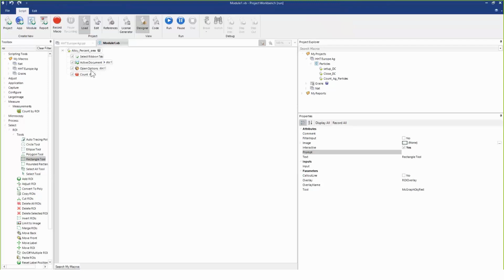In this case, smart segmentation, what parameters I want to measure. And if I have any filtering going on to remove particles that are not what I want to measure, either by size or any other property that's filled within Image Pro. And how I have my display, do I want to show the object filled or outline, or do I want to put the object number display or the actual measurement value on. And that all gets saved in that measurement options file, that .iqo file.